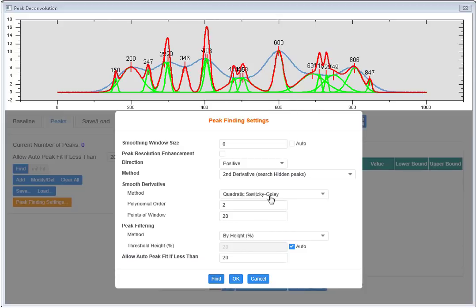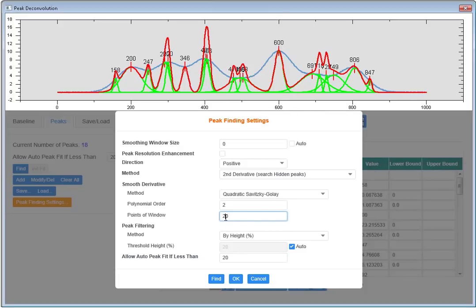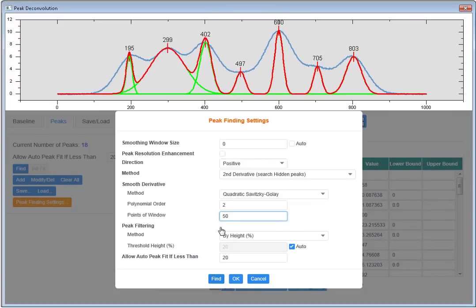The number of peaks is still quite large, and therefore I will change the smoothing parameter to a higher number and try again. Now I am satisfied with the peak findings. The app found all the obvious peaks and peaks in the overlapping areas.